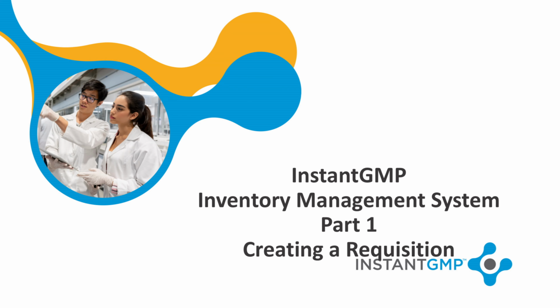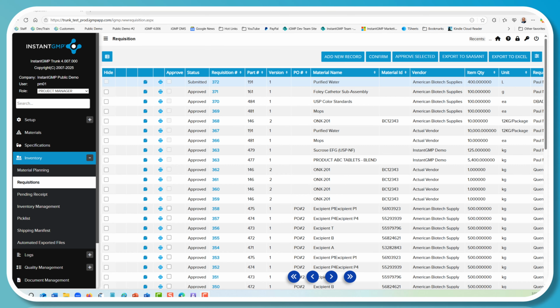In this quick session, we're diving into how to create a material requisition using the Inventory Management module. You'll learn how to build a requisition, get it signed and approved, and prepare it for receiving. Let's get started. First, open up the requisition screen.